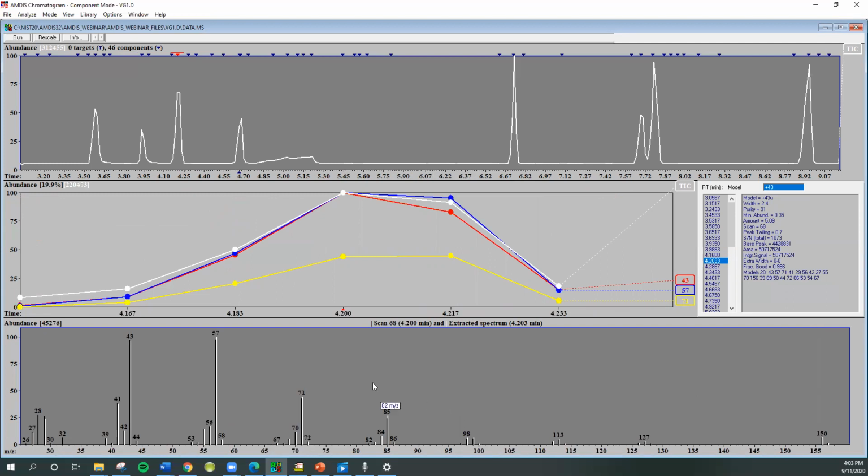On the bottom, you'll see the mass spectrum of the deconvoluted, background subtracted spectrum in white, and the uncorrected spectrum in black. So you see this two-tone spectrum that tells you what you've got. Normally if the black matches the white, it didn't really background subtract much of anything. There is a little air here, 28 and 32, maybe a little argon at 40, but pretty clean.